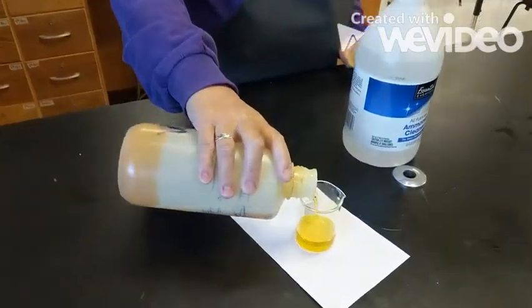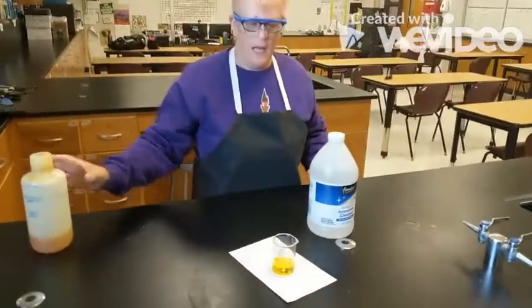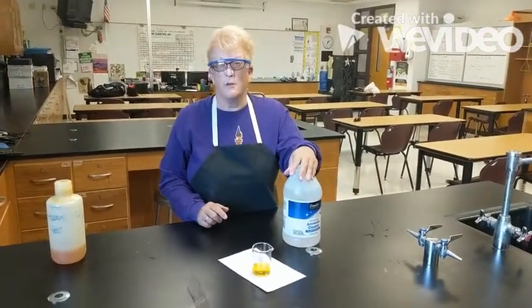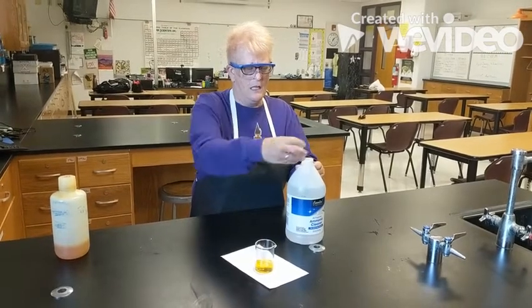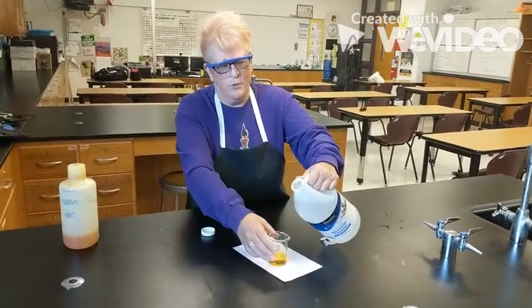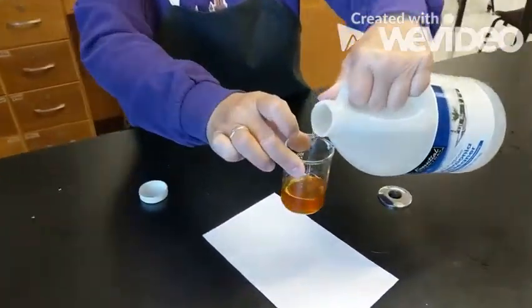It is not a solid, and it has some color to it. And then the other is ammonia. So you may have ammonia at home, and ammonia is a liquid as well, and I'm going to carefully pour some in so you can still see what happens.